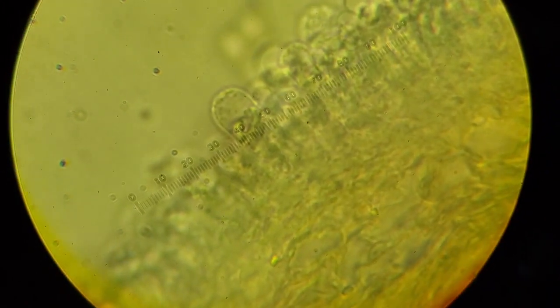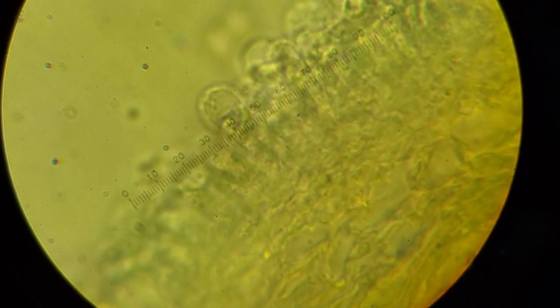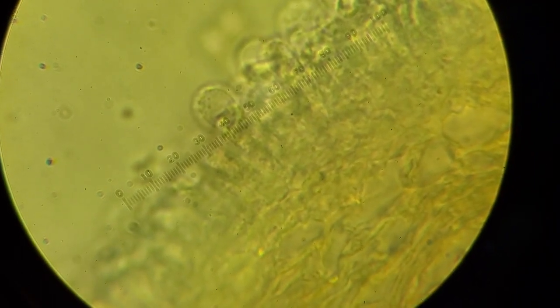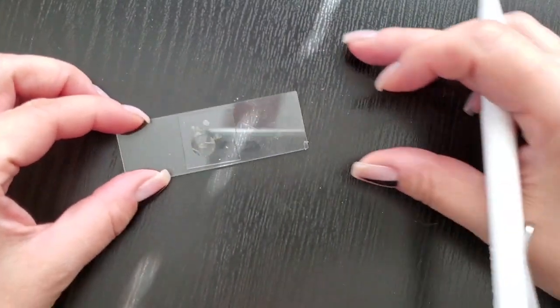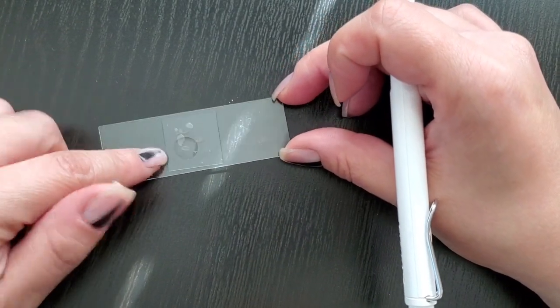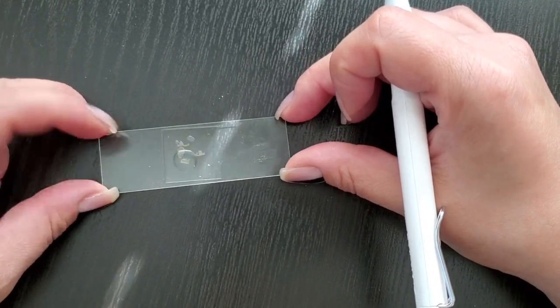And one last thing you can do with this section, let's say you're unhappy with it, you can actually take this section when you're done with it and make a squash mount and then look at the same exact structures spread out apart. So what I like to do with these squash mounts is take a section that I've already made and I've looked at it and done whatever I needed to do with it, but it's still valid. There's still things I can see.